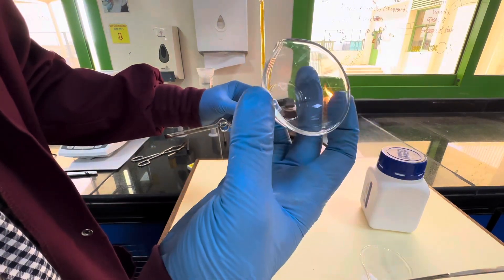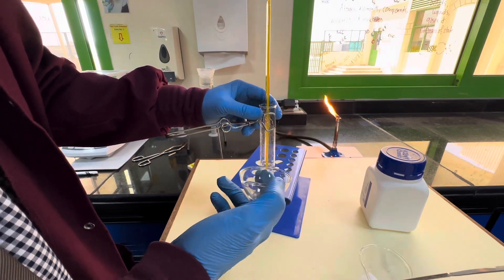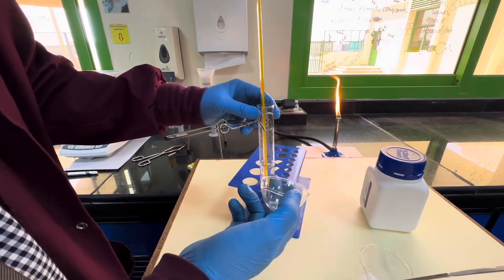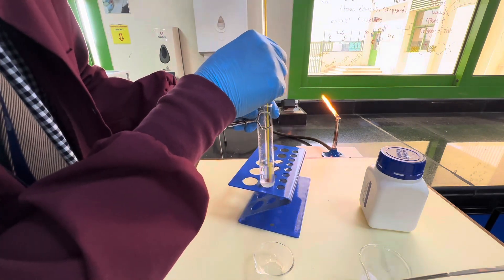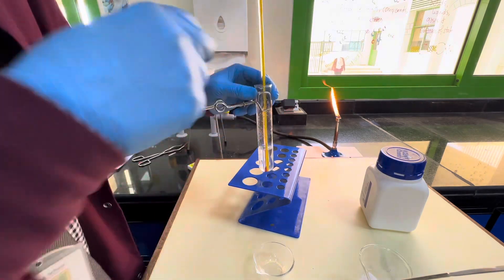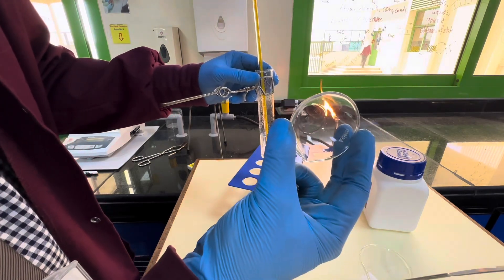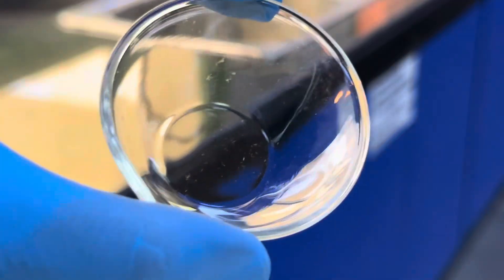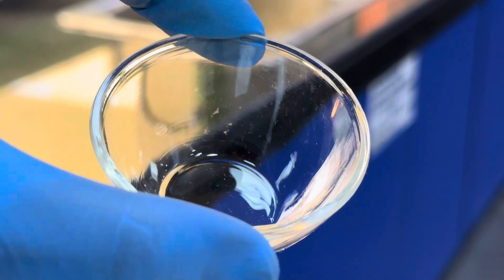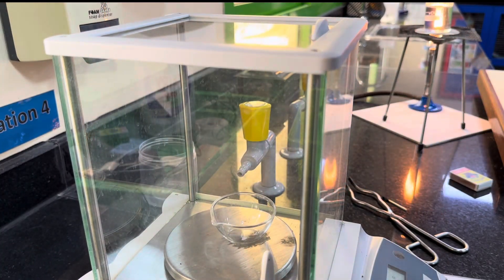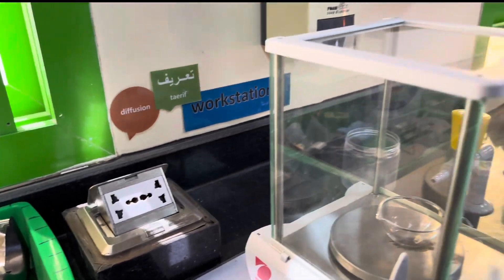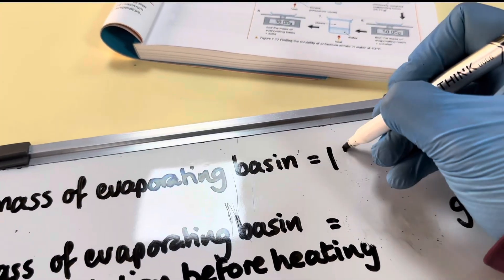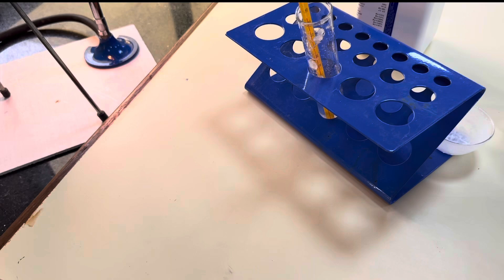Now while I wait until it goes down to 40 degrees I'm going to pre-weigh this evaporating basin and I'm going to slowly pour some of this liquid into here. This will help me measure the solubility of this potassium nitrate at 40 degrees centigrade. Here is my empty evaporating basin. The mass of that is coming out to be 19.33 grams. Now I'm going to add some of this saturated solution to the evaporating basin.